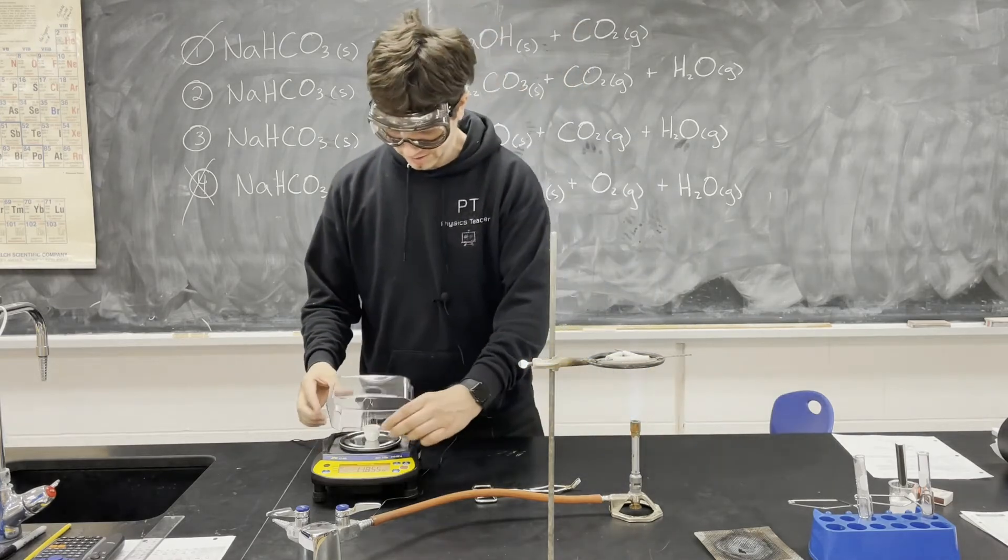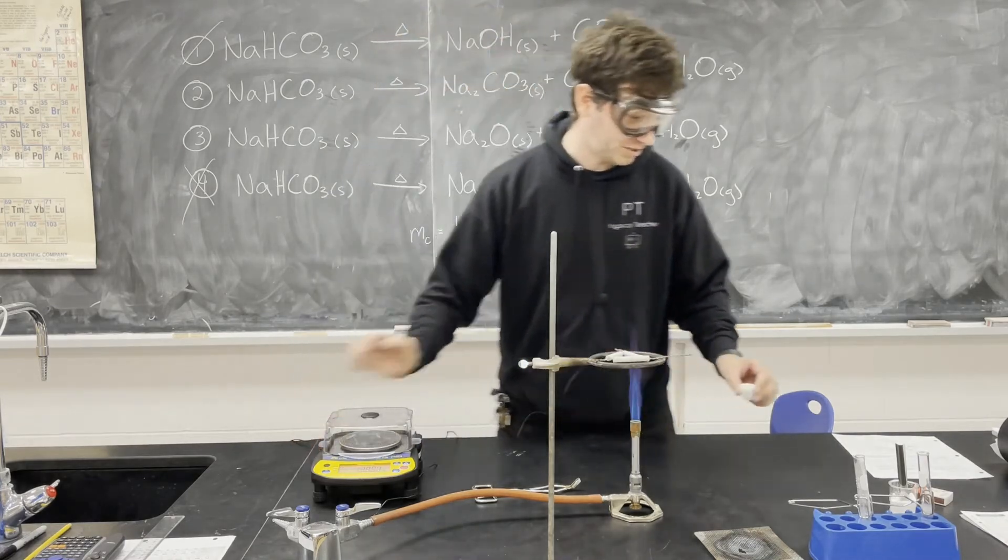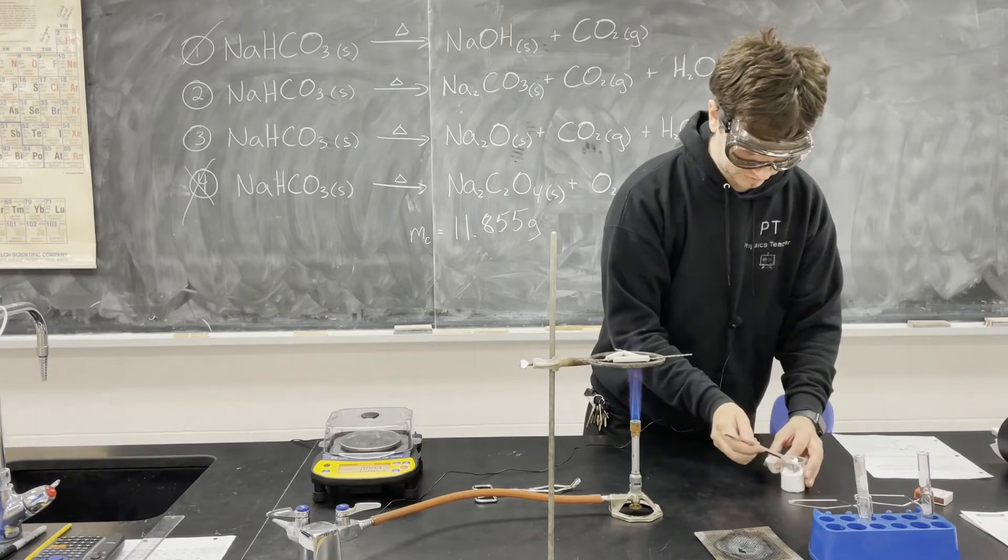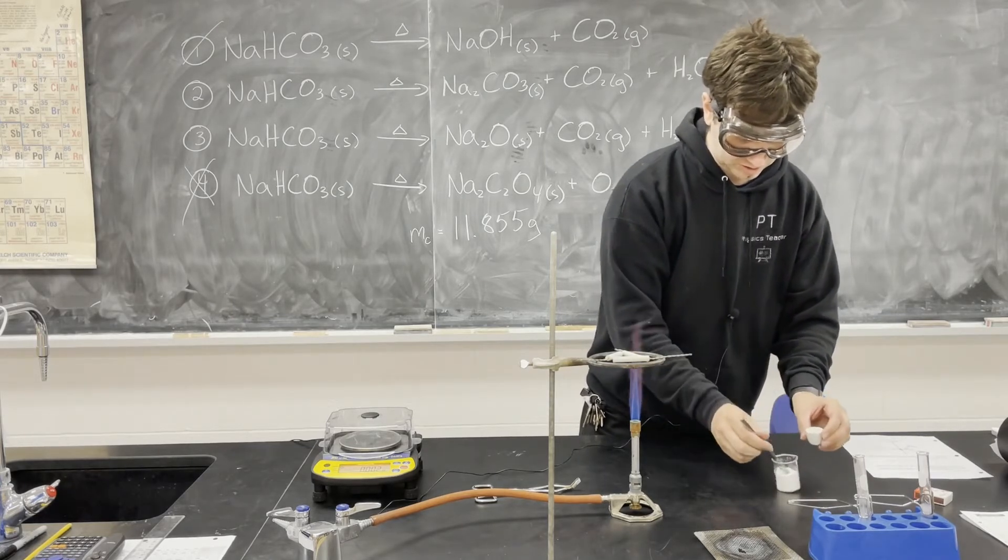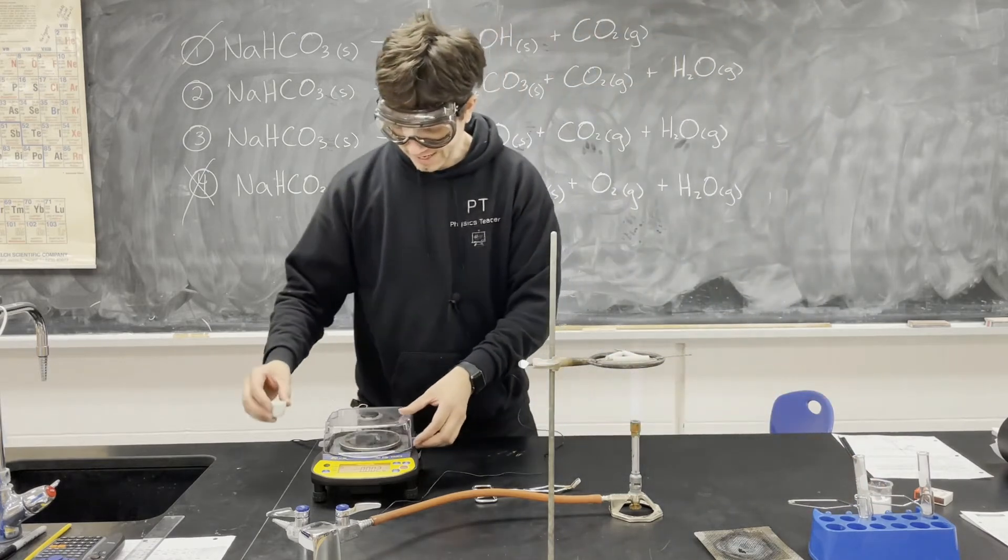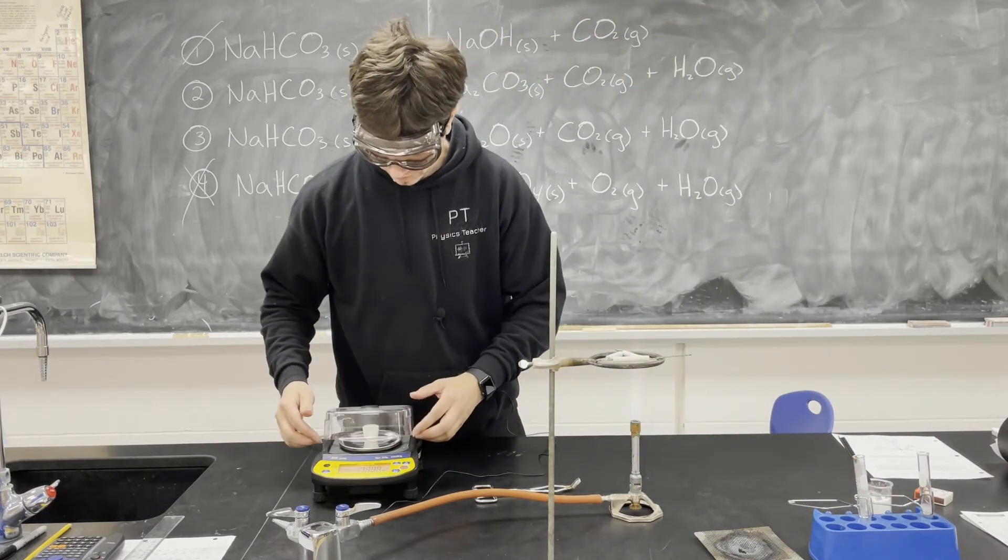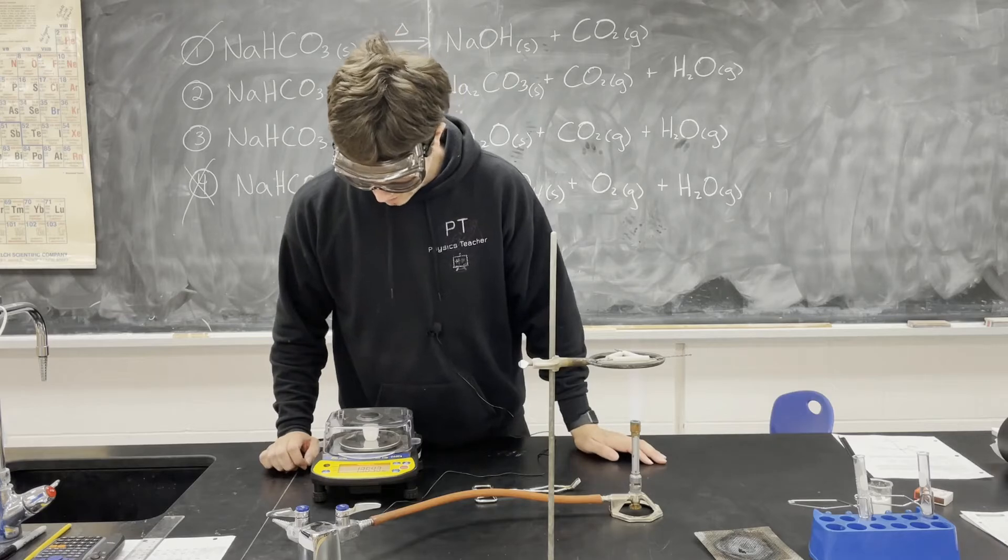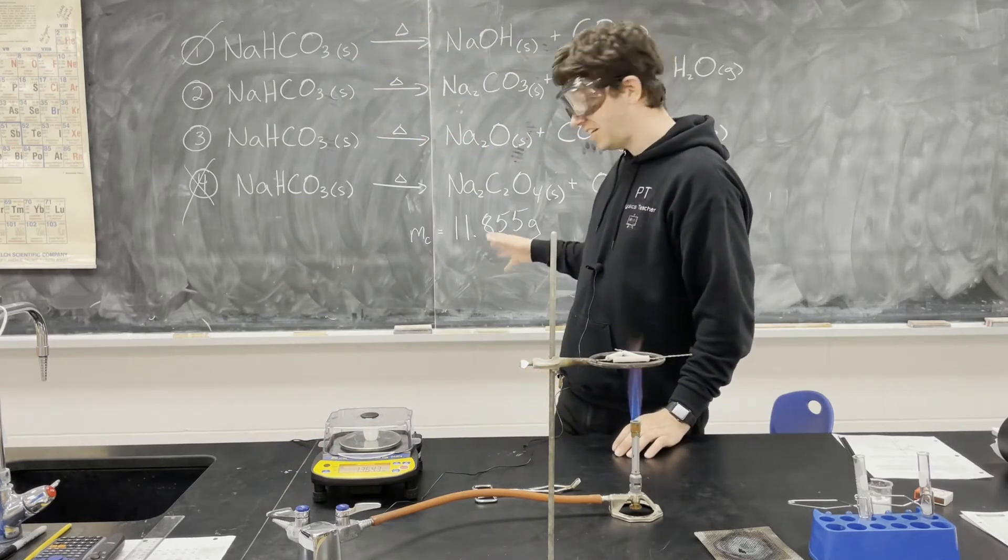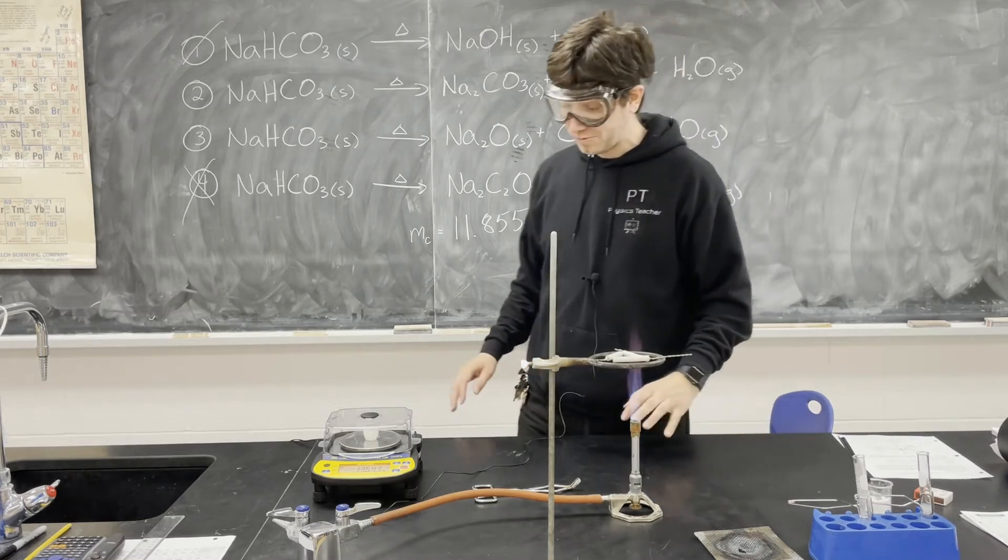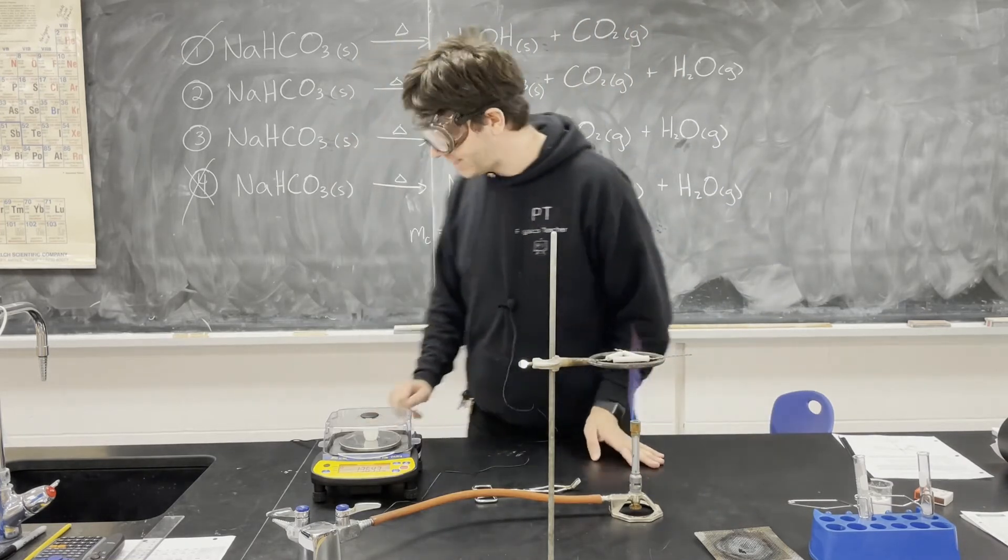All right, so let's put in about 2 grams of baking soda. And let's measure this again. So, that's 13.6. That's just under 2 grams, but that'll work. 13.643.